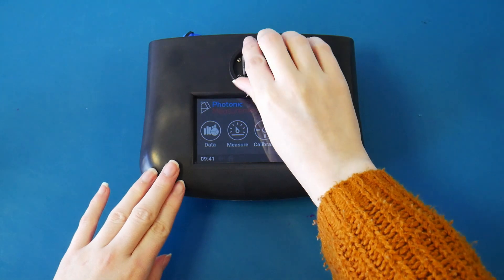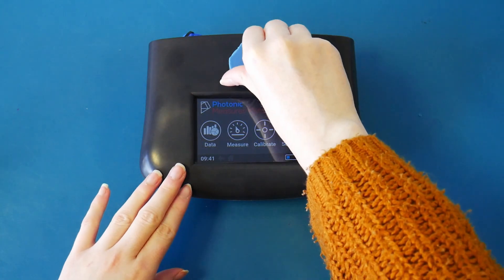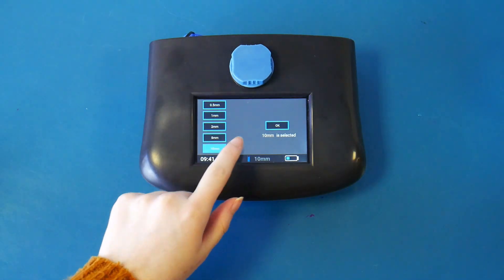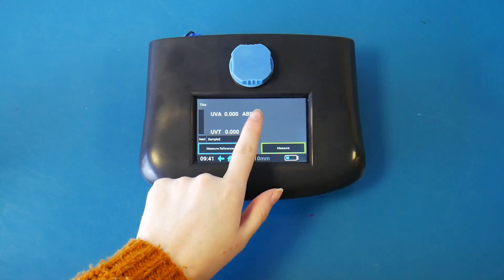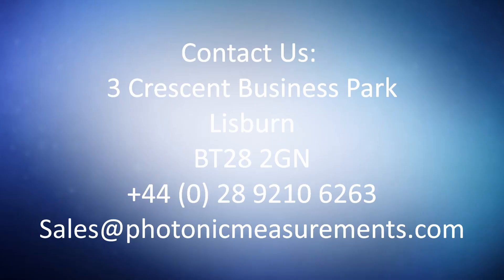Then place into the GO, ensuring clear sides are facing the light path. Place the cap back on and press measure. It's that simple.